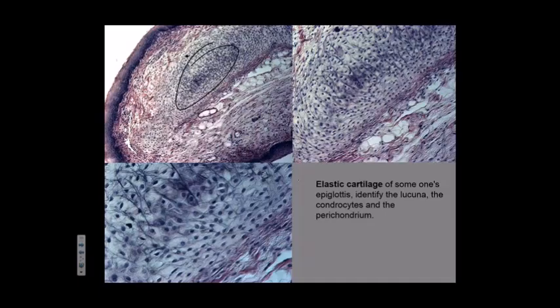Here's some adipose. This red stuff right here is dense irregular connective tissue. Here's some more of it out here. And this right here is non-keratinized stratified squamous epithelia. And we have chondrocytes in the lacunae.